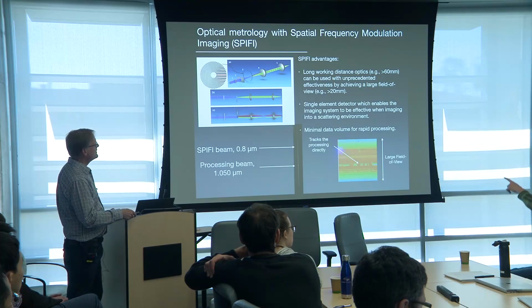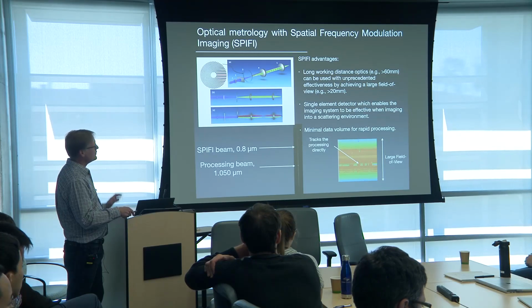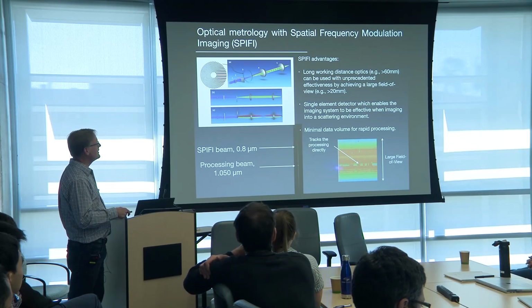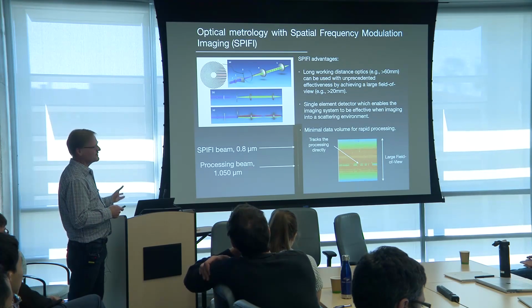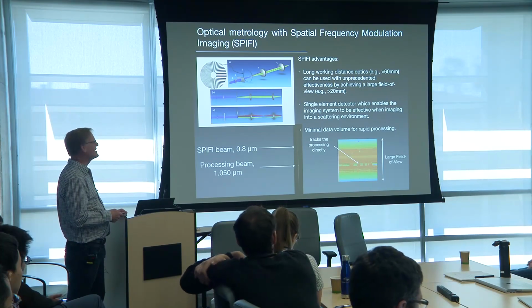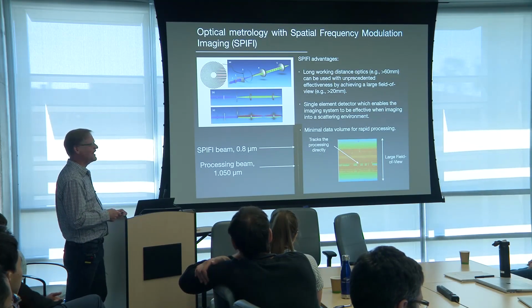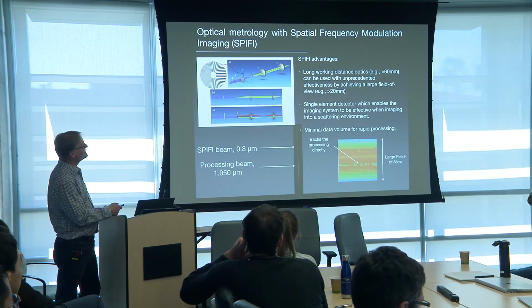Like for instance, there's a green line. What we haven't done here is, in a lot of our images, we'll actually normalize out the profile. But this is kind of hot off the press. We literally took a dirty piece of glass and you pick up different things in the glass. Well, yeah, that blue dot, that's a piece of dirt or something.